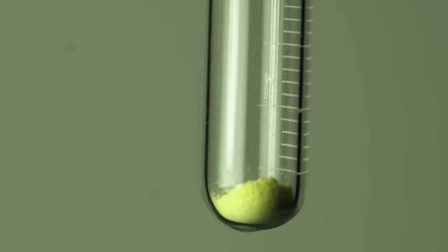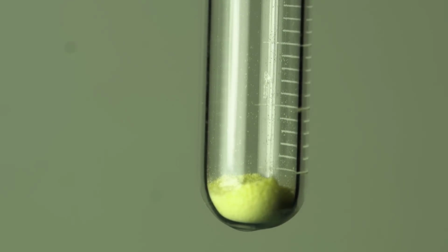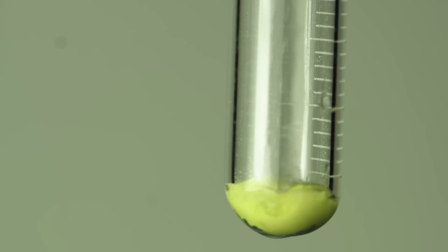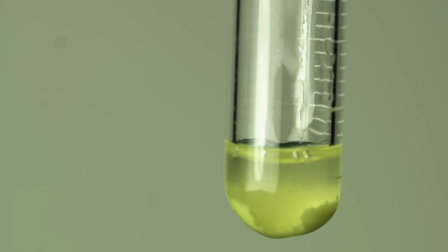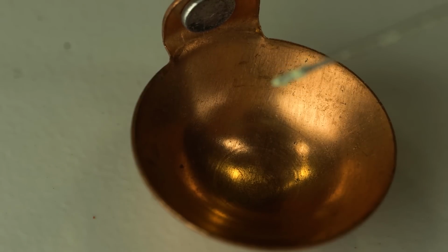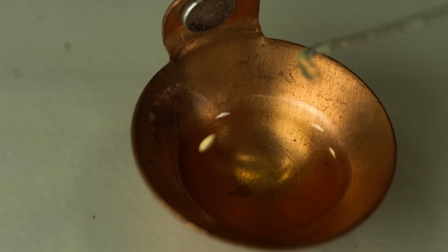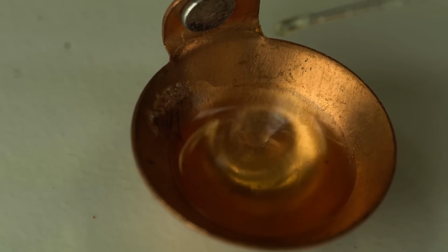Carbon disulfide is the best solvent for elemental sulfur. Sulfur dissolved in carbon disulfide reacts with copper at room temperature. Look how a copper spoon gets covered with black tarnish. It's copper sulfide forming.